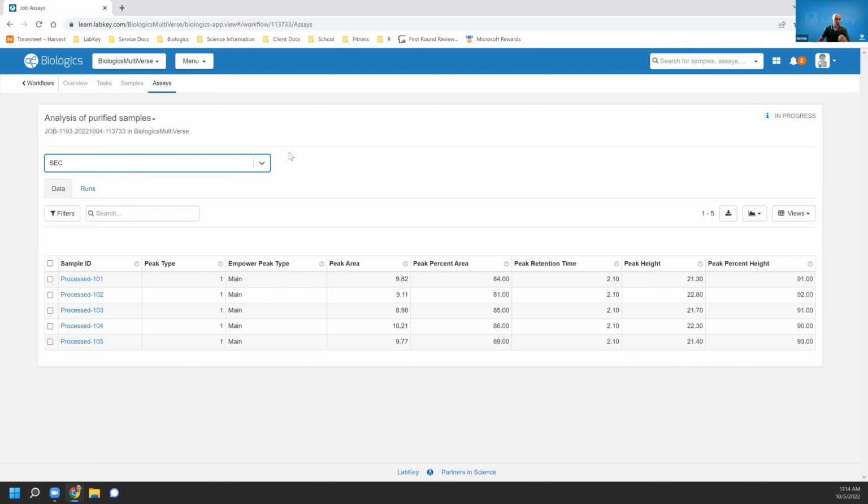Now, furthermore, as I think I kind of mentioned in the Q&A, this experiment data is automatically connected to the samples that I have listed here. So as I worked through this job, as I worked through this request and imported this data for the set of input samples that were available, this information was automatically connected.